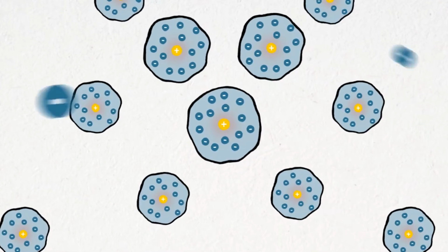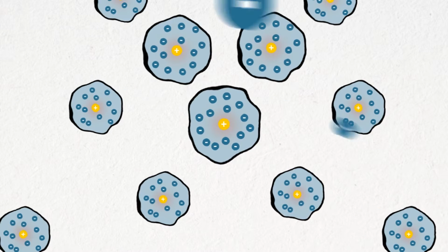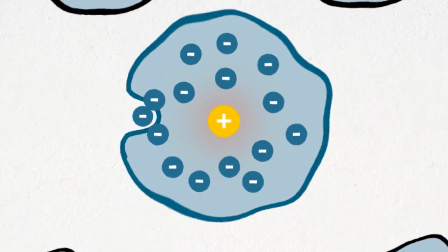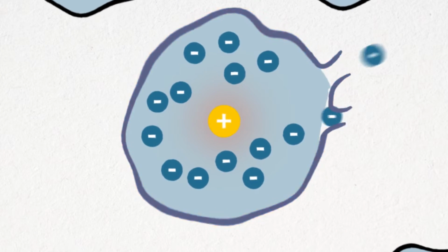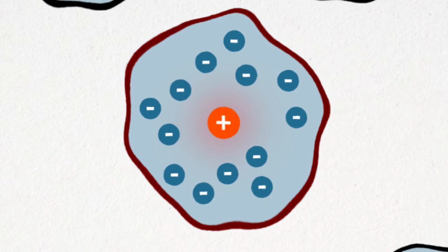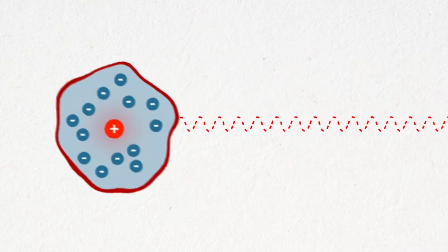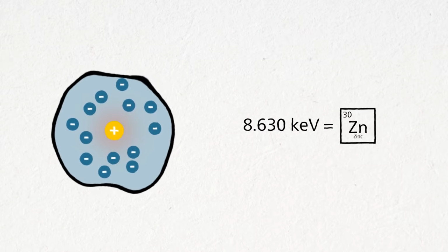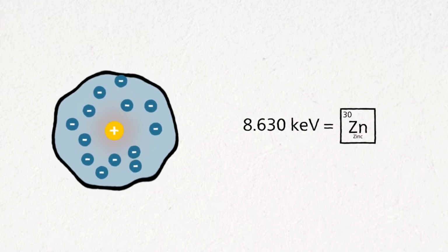But what is happening inside the sample, and where is the signal we're analyzing coming from? Let's have a look at it. When one of the electrons from the primary beam enters the electron cloud of one of the atoms making the material we're analyzing, there is a fair chance that it excites it enough that one of the electrons of the atom itself is ejected. If this happens, an X-ray is generated, which has a very characteristic energy that can be associated with the atom that generated it.